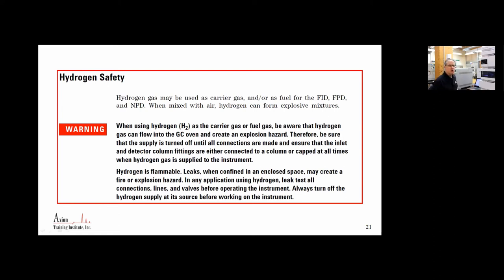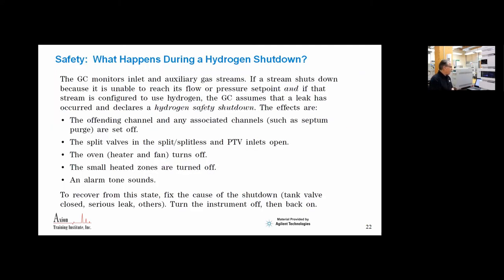So do be careful with hydrogen. Our biggest concern would be a column breaking inside the oven. Fortunately, the way I look at it is if a column breaks usually up close to the inlet, the pressure drop is so severe that the GC notices that and will generally shut down. What happens during the safety shutdown? The offending channel and any associated channels are shut down. All the split valves are open. We want to get rid of any trapped hydrogen that's in there. Nothing pressurized, the oven, the fans, all the electronic zones are turned off and the alarm, the European police car alarm, goes off. And when you have that problem, you can't simply press a button. You have to shut off the GC and turn it back on to resolve that.